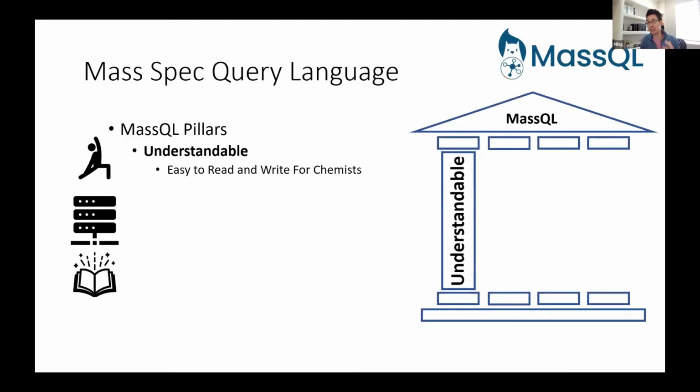And so I think the answer is yes. The thing that I invented is called the mass spectrometry query language. This is a very computer science way of tackling this problem. I think a lot of mass spectrometrists, people in the field, would create a nice user interface with nice drop-down menus and things like that. But instead, I go the route of: what if we can just say a sentence and it does everything we want?